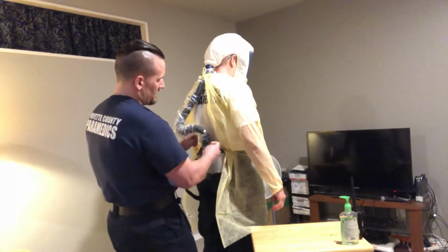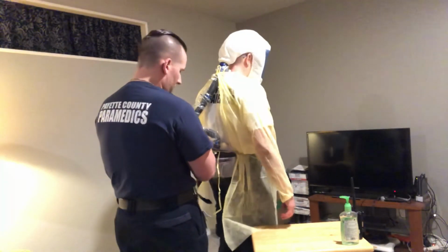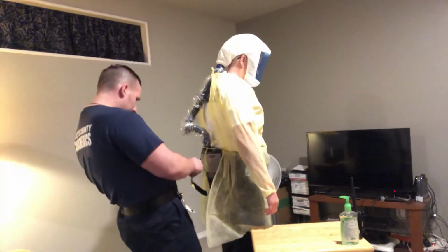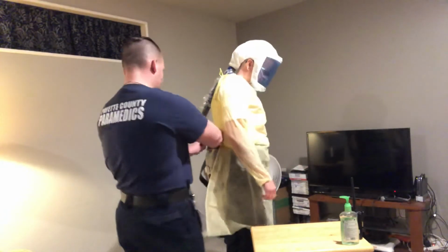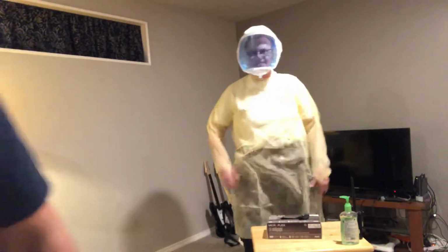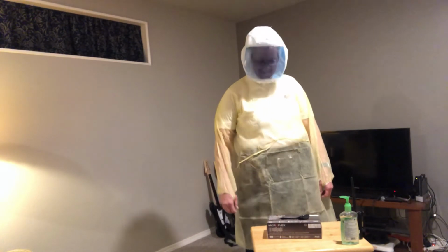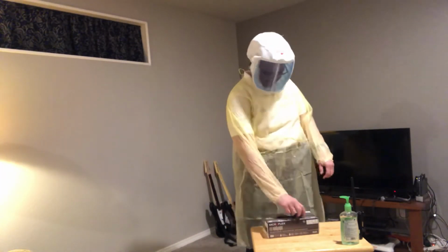Tying skills. Oh, well, okay, no, it works. It works. I'm just a little too macho apparently, and I'm just ripping things. But, all right, you know what? We're tied. Good enough. We're tied. We're good. Okay. I'm just busting gowns. Oh man, gowns and me just don't get along today apparently. Okay, so anyway, guys, that's tied in the back. Just roll with it. All good.